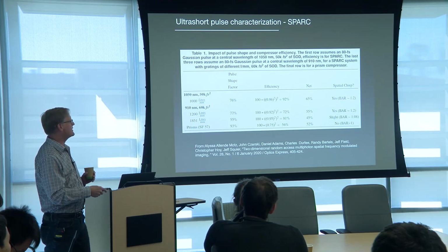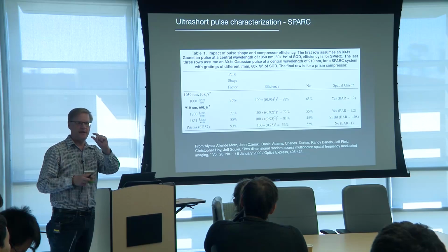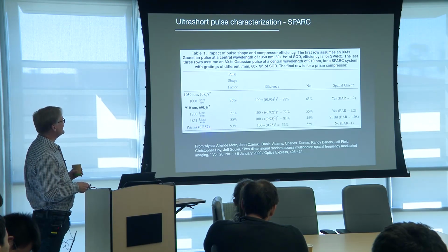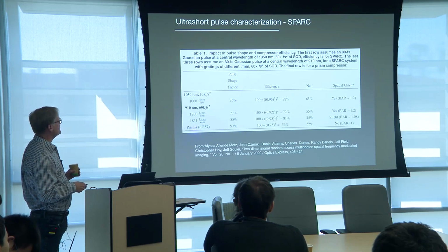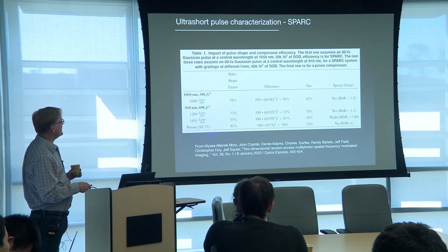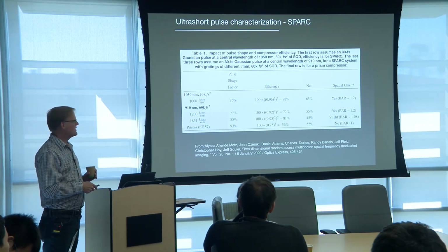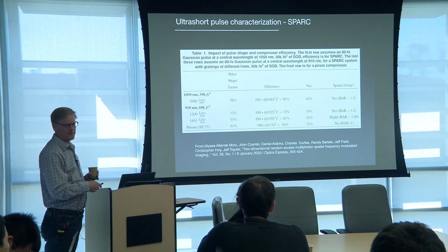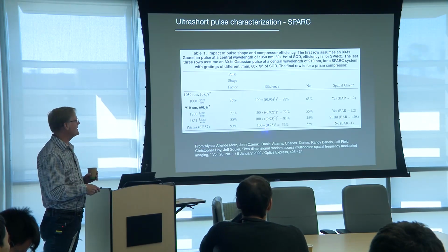This is really a quantitative metric that tells you how bad your chirp is. And then I compare it to prisms down here, where this is for 60,000 femtoseconds squared at 910 for SF57 glass. You end up with a little residual third order there, so you don't get perfect. So you take a little bit of a hit there.